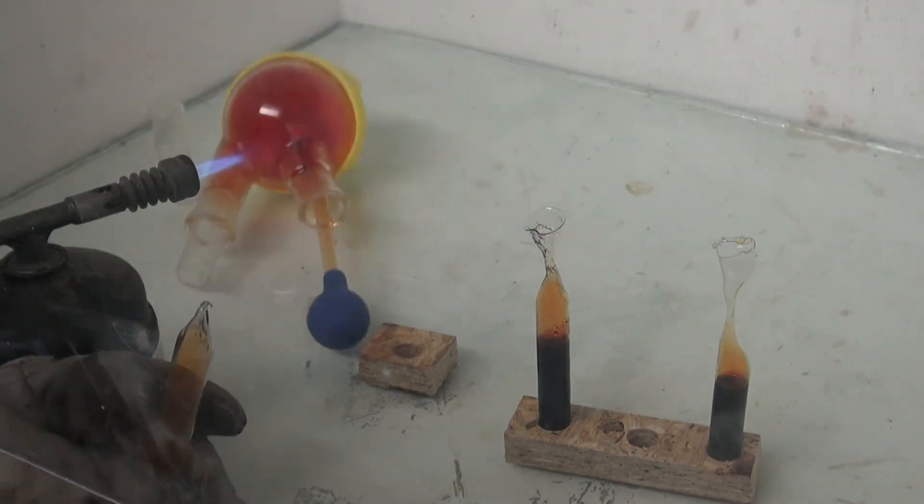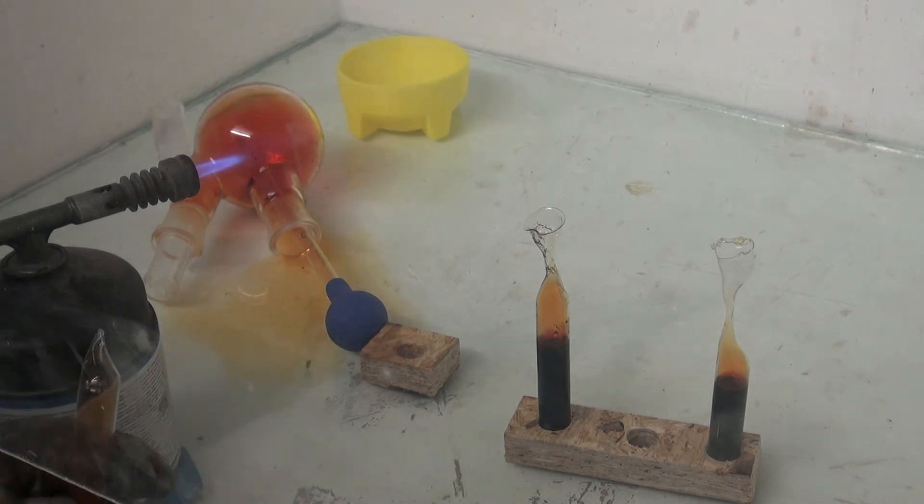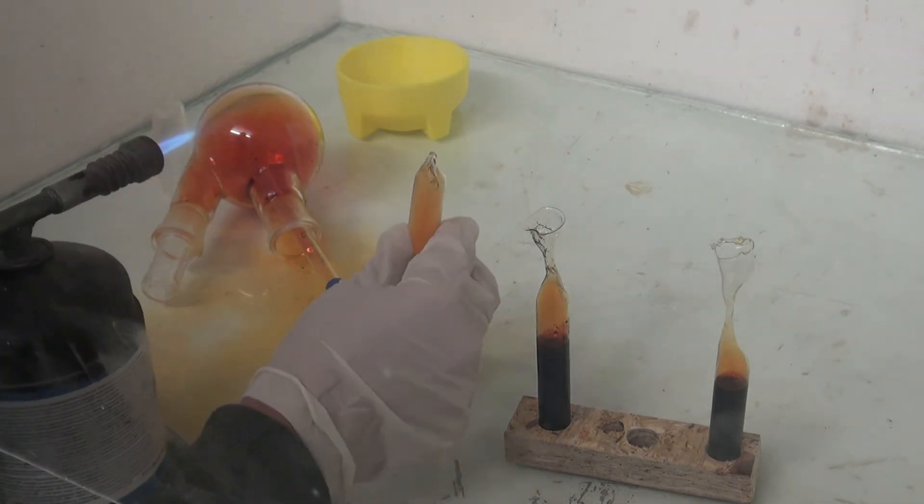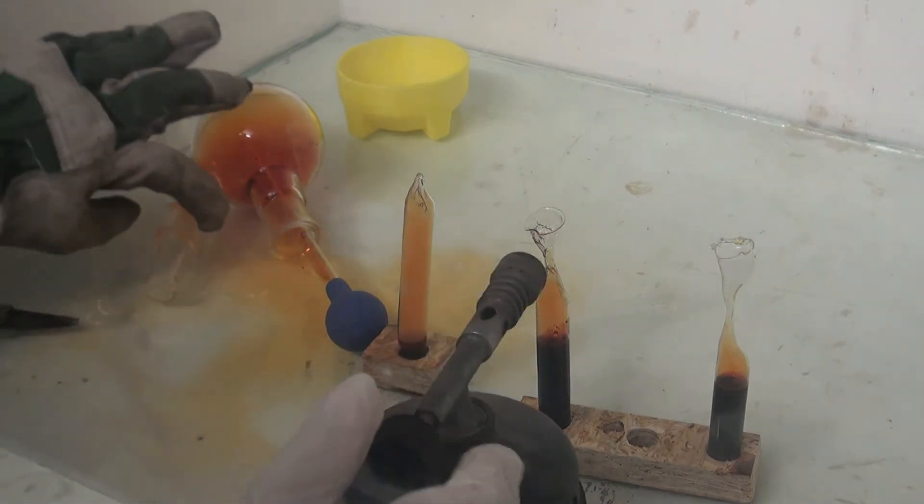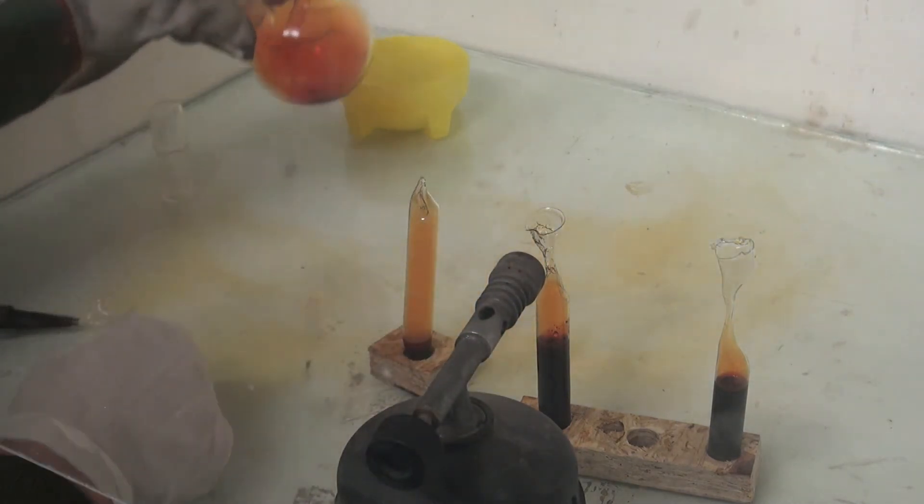Everything worked fine until the flask fell over because of my stupidity. A lot of toxic red bromine gas poured out, but luckily my fume hood was working.